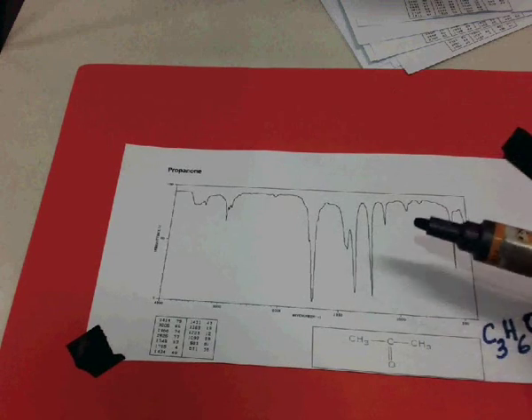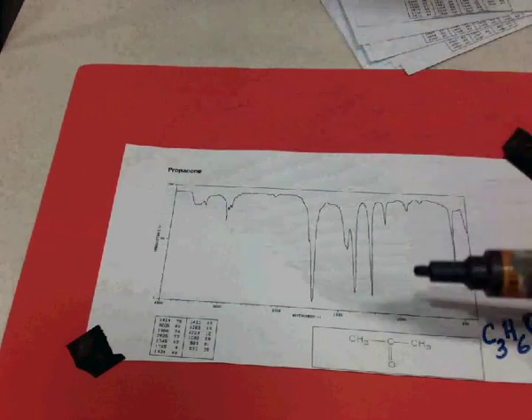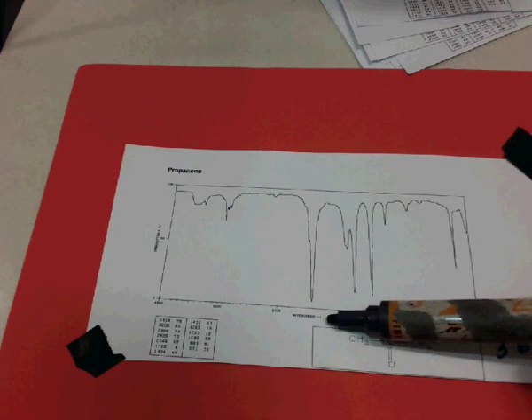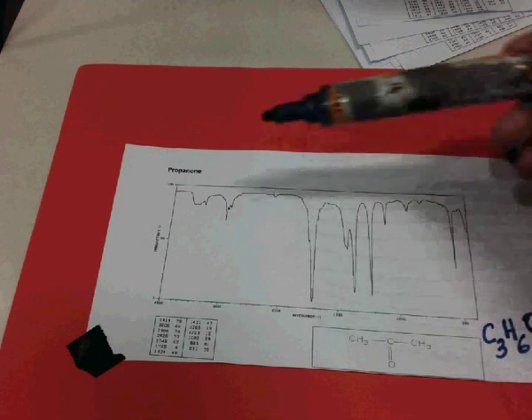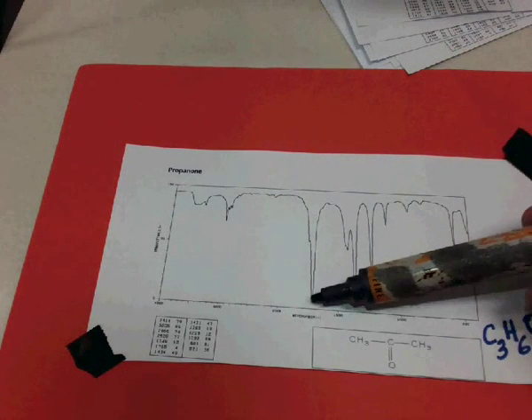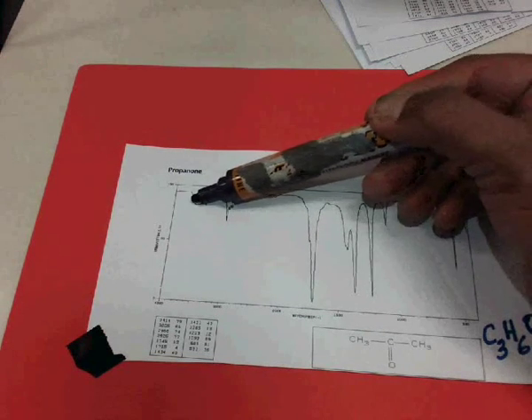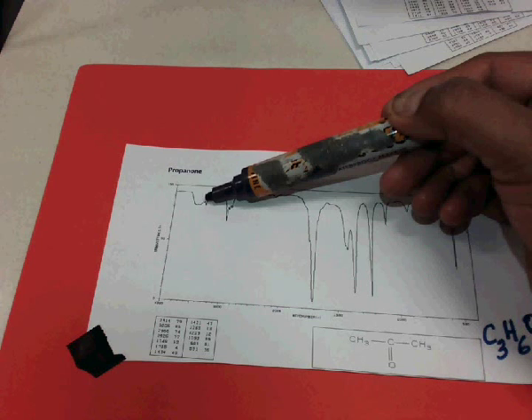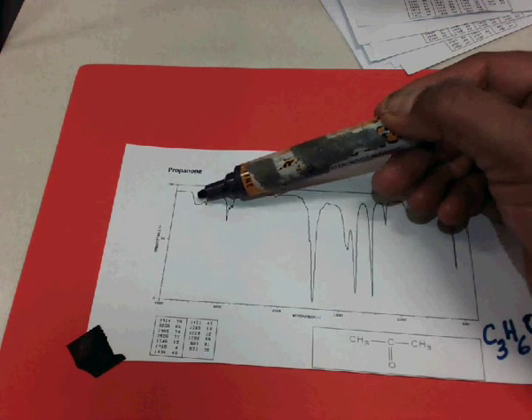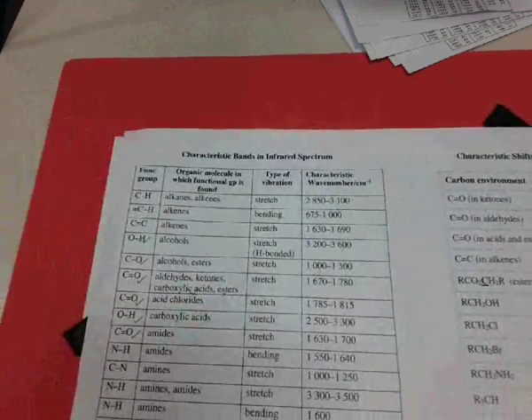Remember, your IR spectrum is a plot of transmittance, which is on the y-axis, and wave number, per centimeter, which is on your x-axis. These are called peaks. This one would be a narrow, sharp peak, whereas that peak there I would call broad, and not so strong. So pull out your data sheet and look up what you will be identifying.